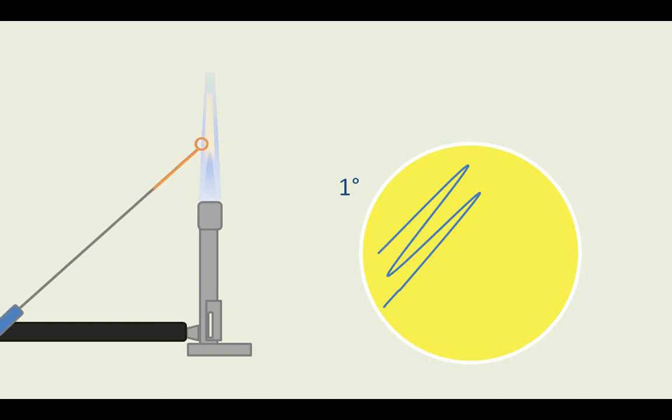Now flame the loop. This kills whatever cells are remaining on the loop, so that no additional bacteria are brought onto the plate. Remember, the idea is to dilute the bacteria to get individual, well-separated colonies.